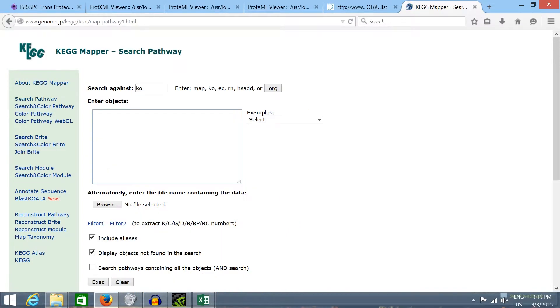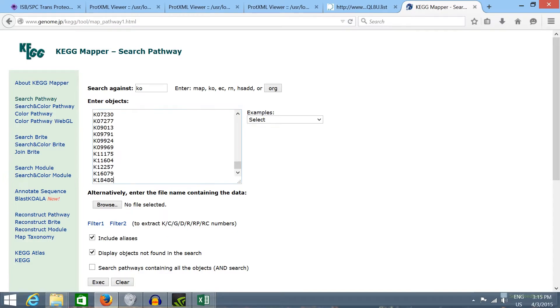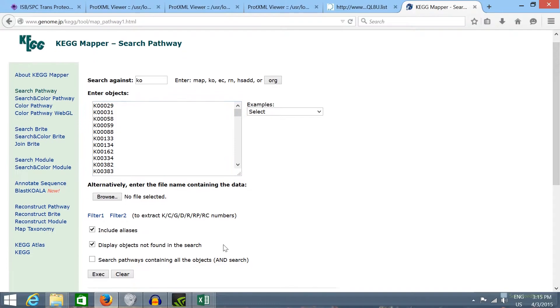I'm going to click in KEGG mapping and here in KEGG mapper tools and in search pathway. Here in this box we should paste all those pathway IDs that we have just mapped from the proteins in UniProt.